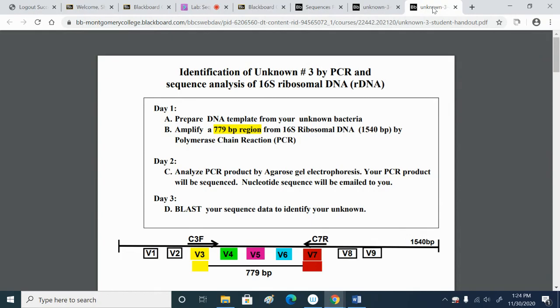which was just learning how to use certain databases to identify unknown organisms by using a sequence of DNA. So we're going to talk about how we actually would have extracted the DNA and then used it for sequencing. So what we would have done in the first lab is actually prepare our DNA template from bacteria. So each group would have received 2 unknown organisms to play with.